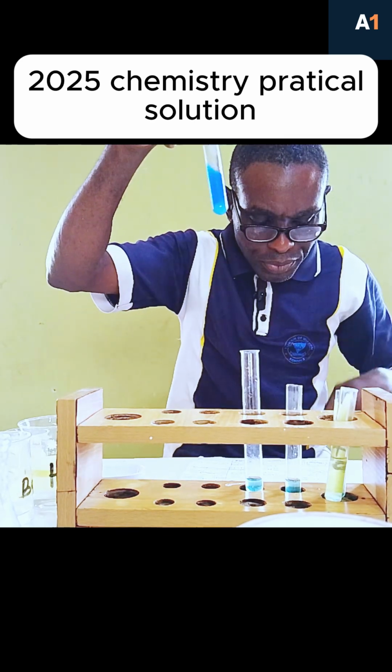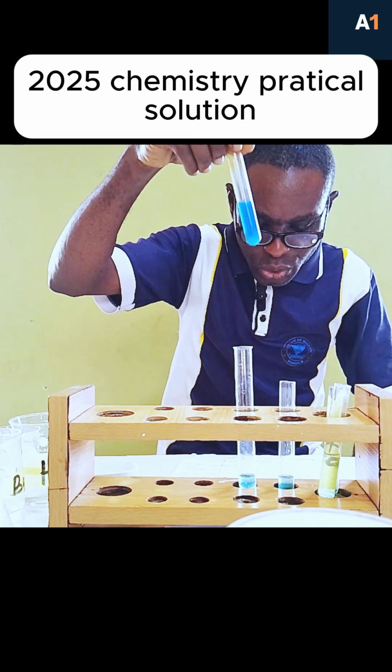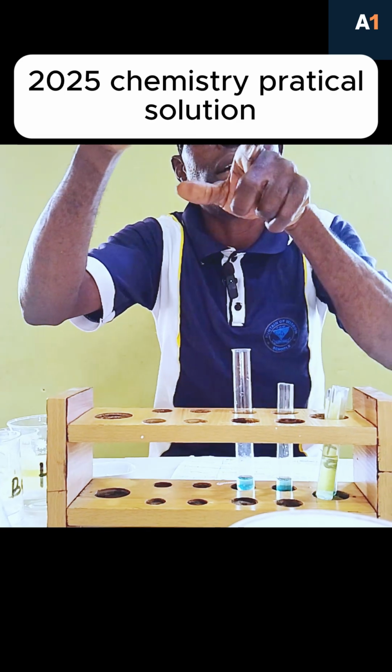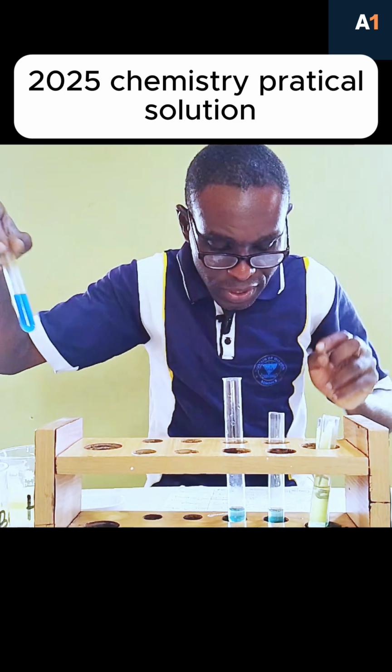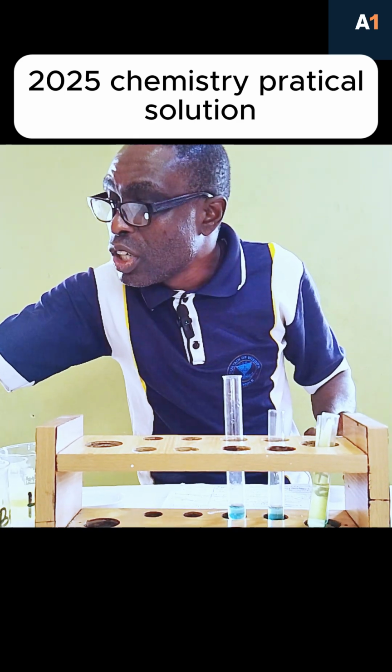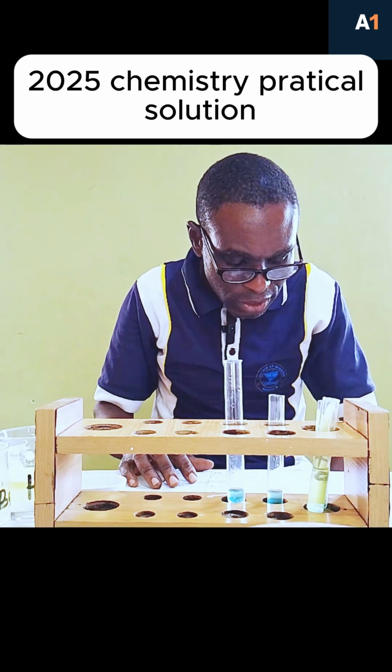There is no particle there. And if you check it, it is soluble. You can see no particle. If you compare the first and second, no particle here. So it's whatever you see. It's you that will do it. Whatever you see. Now let's look at the third one.